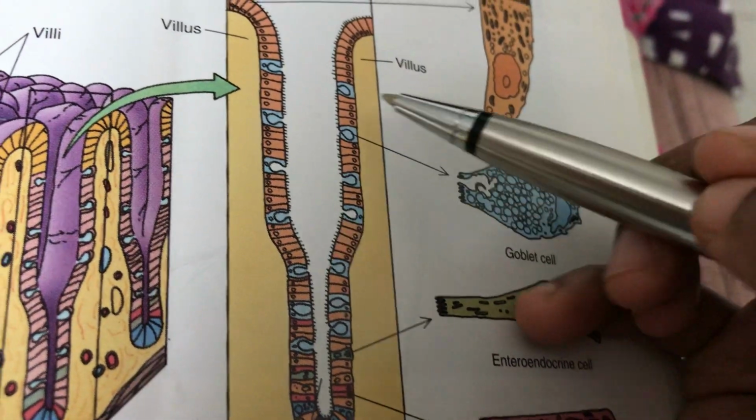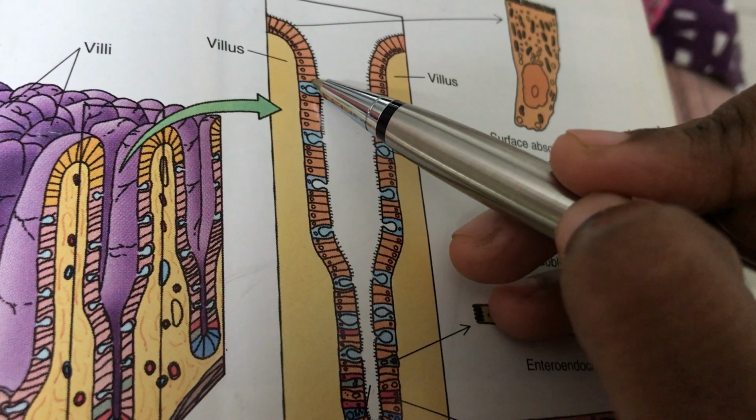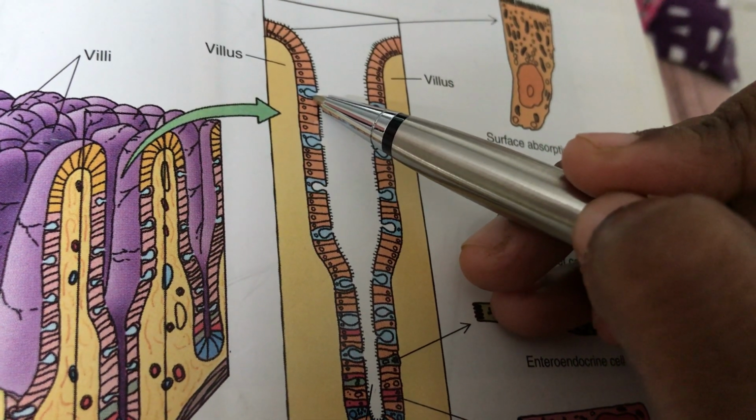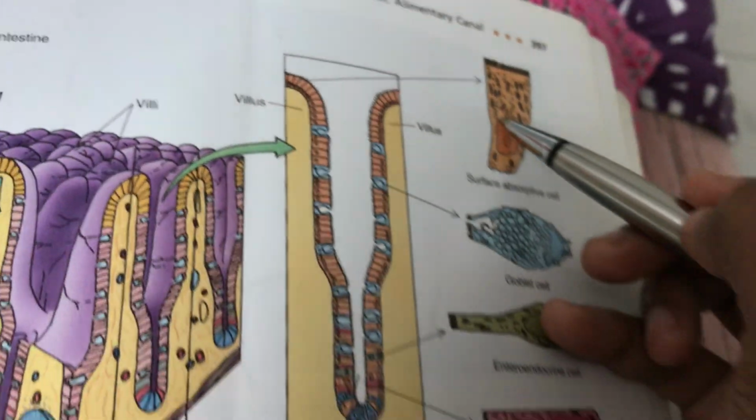What are the cells present in the crypts? You can see the crypts nicely. In the small intestine only, you will be having the goblet cell. Don't ever say goblet cell in the stomach. Stomach doesn't contain goblet cell. So here, what are the cells that are there?